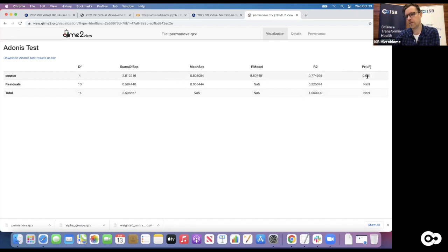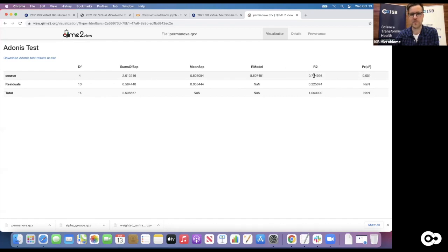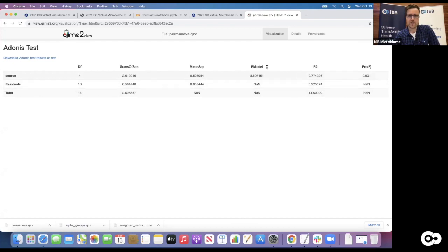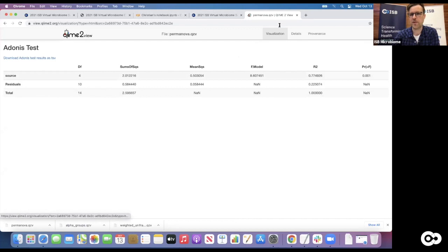The p-value here is the permutation p-value - it cannot be smaller than 0.001 in this case because we only ran 1000 permutations, so in the best case our F value was larger than all of those, giving that minimum p-value. This would be very significant. So most of the inter-sample distances are indeed explained by the source they came from - that drives those distances. About 22 percent of the variance in the beta diversity matrix is not explained by source, driven by other factors. That gives you a hard statistical test confirming the obvious separation we saw in the projection.